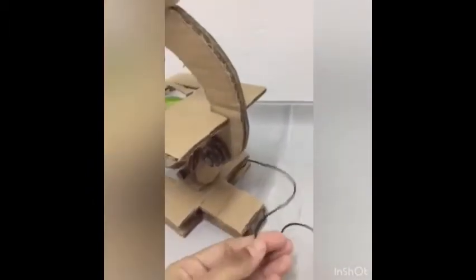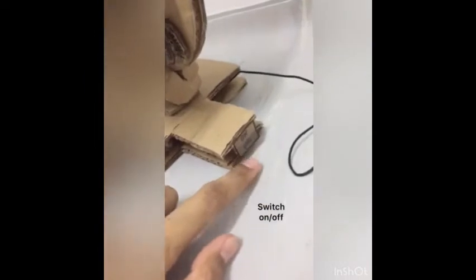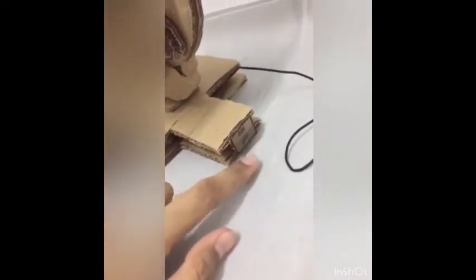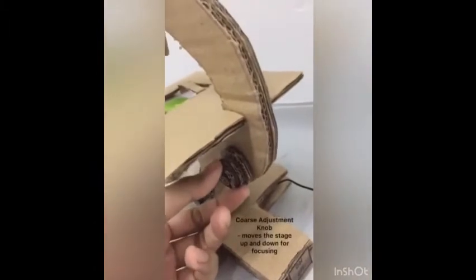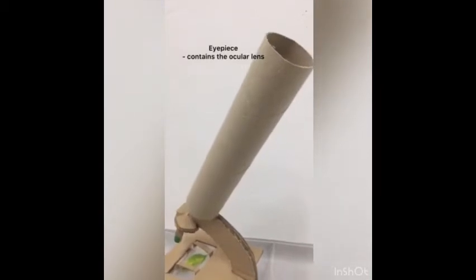First, we have the wire here to connect to the plug, and then we have a switch on and switch off to open the microscope, and then we have the coarse adjustment knob to move the stage up and down for focusing. Next, we have the arm, used to support the microscope when carried, and then we have the eyepiece, which contains the ocular lenses. You can see the specimen through this eyepiece.